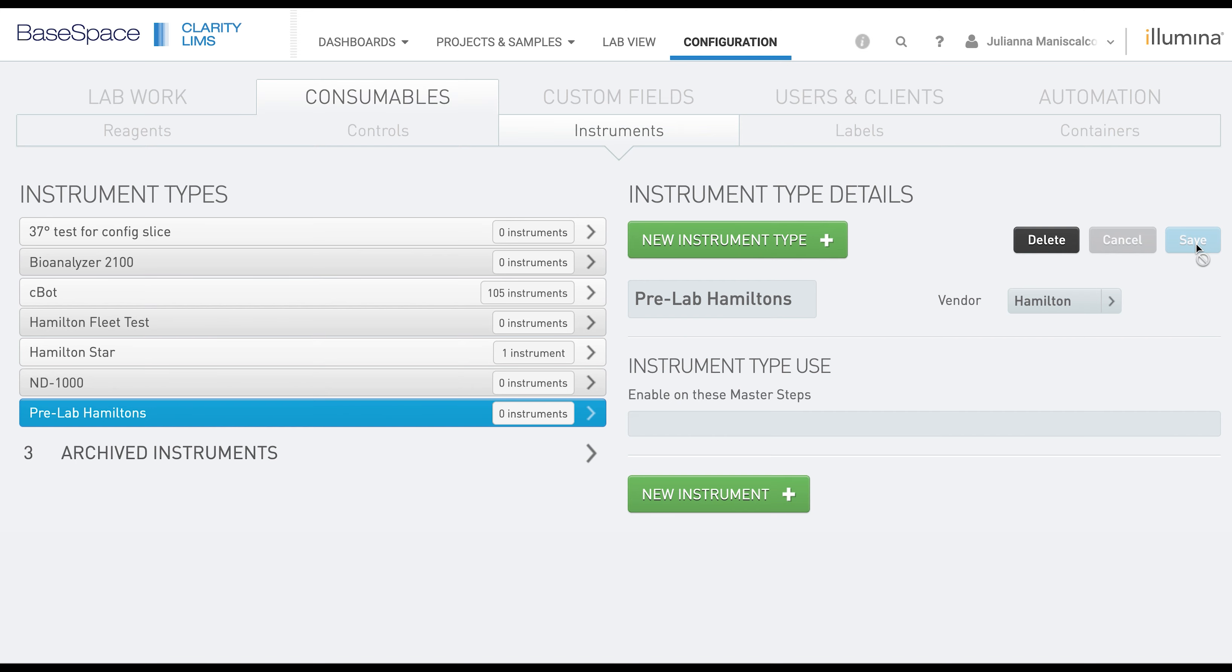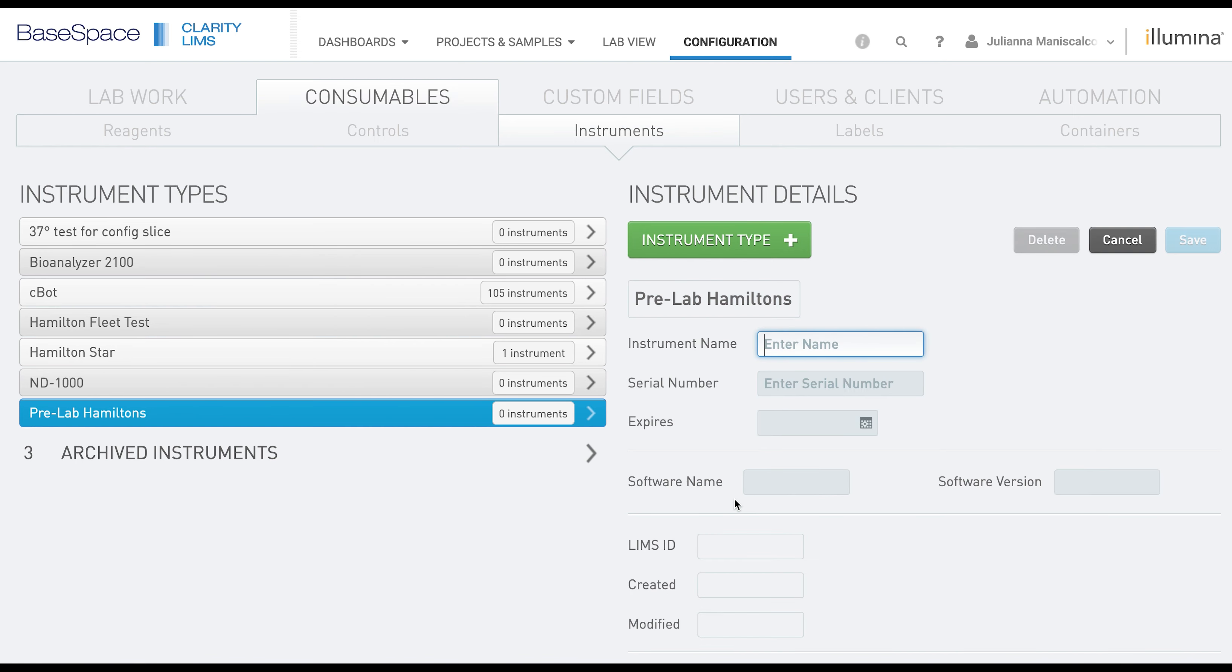From here we will add the individual instruments that should belong to this type. First you're going to click New Instrument and each instrument will need a name.